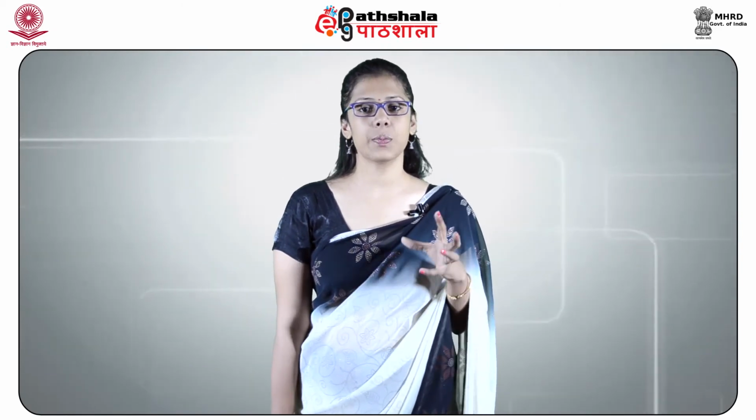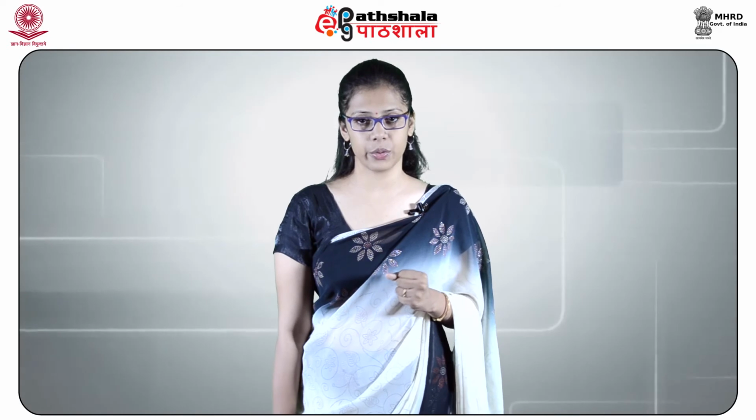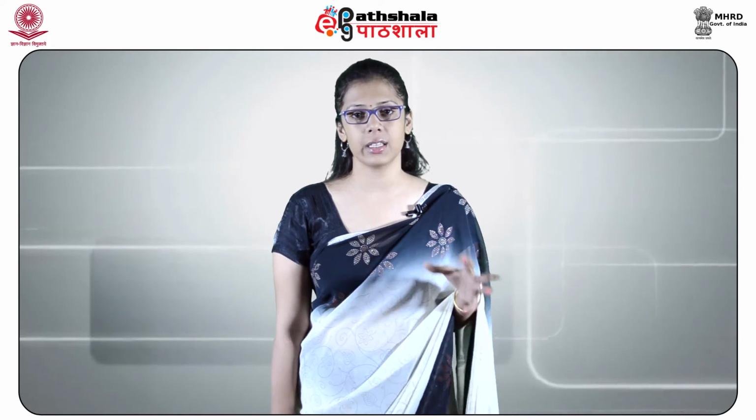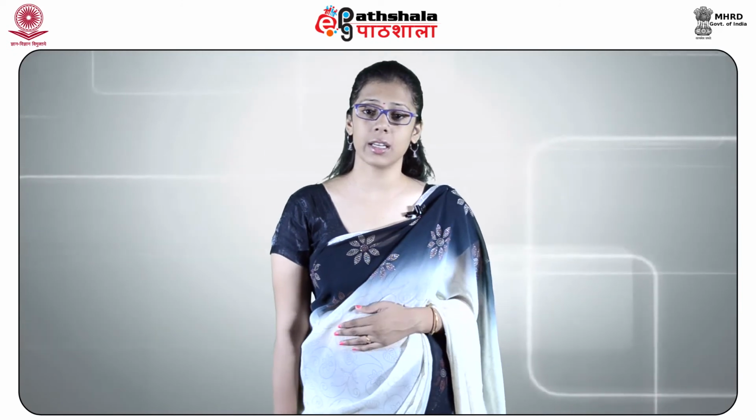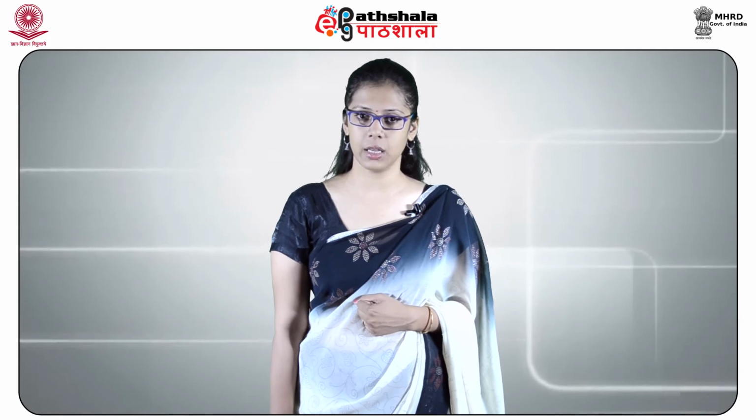All of the methods that detect P30 rely on the formation of an antibody-antigen complex. If semen is present in the stain, the binding of P30 to the test antibody produces a visual result. The lack of a result in any of the tests would indicate that the stain does not contain semen or that not enough is present to facilitate a visible reaction. This test can be used alone to confirm the presence of semen, or it can be used in conjunction with the microscopic method described in the previous section.